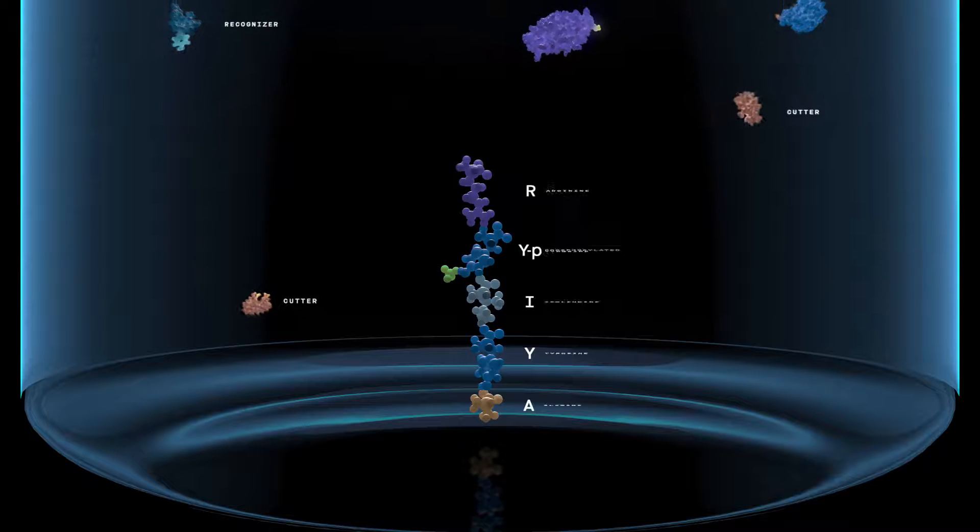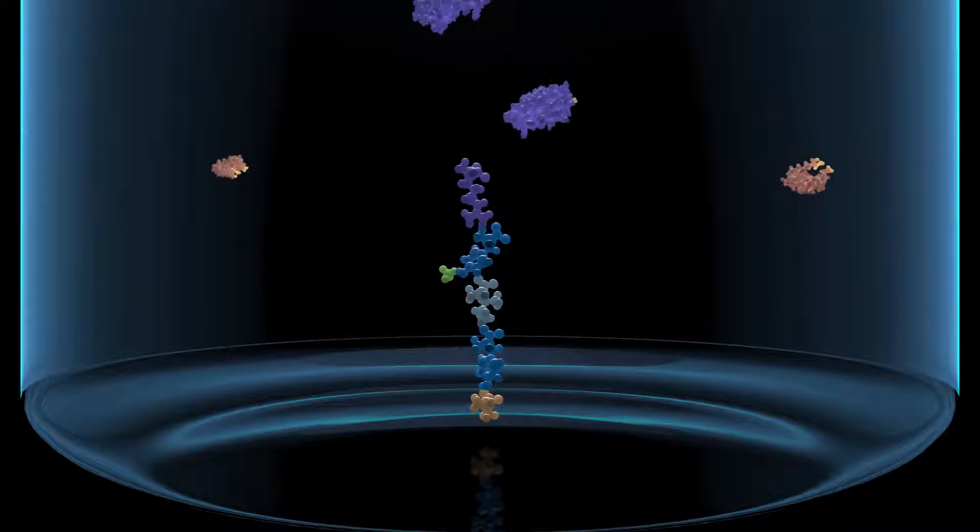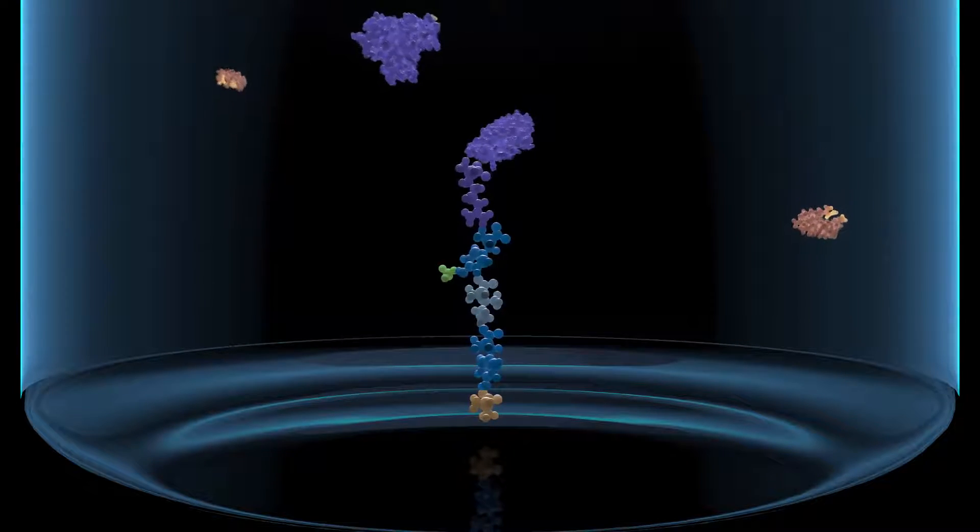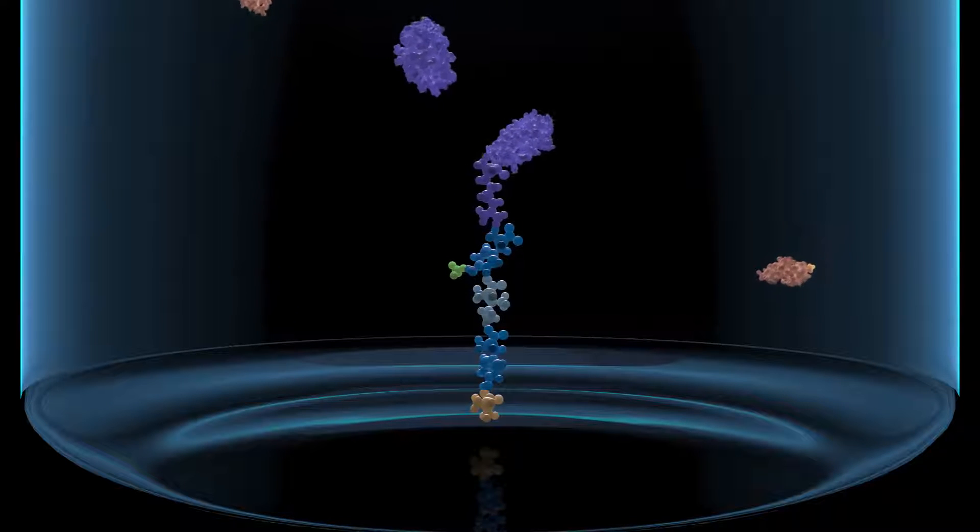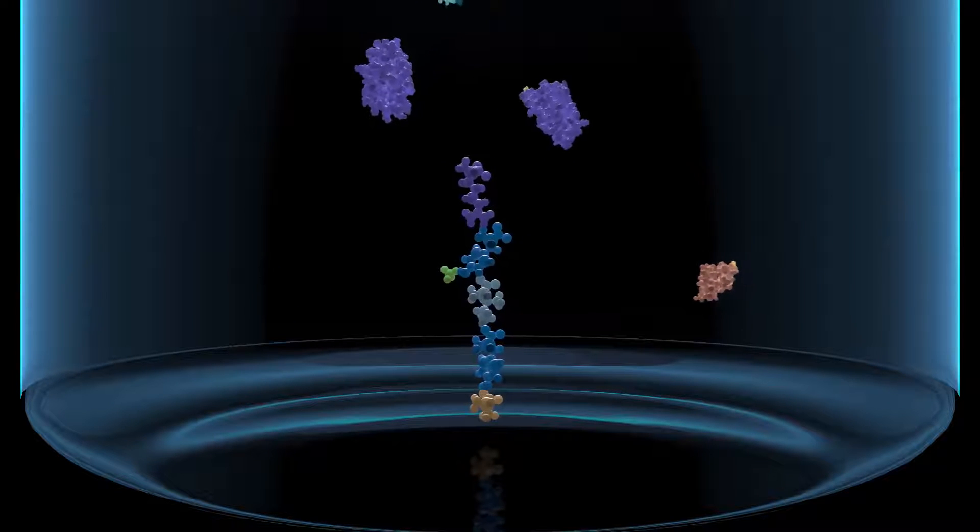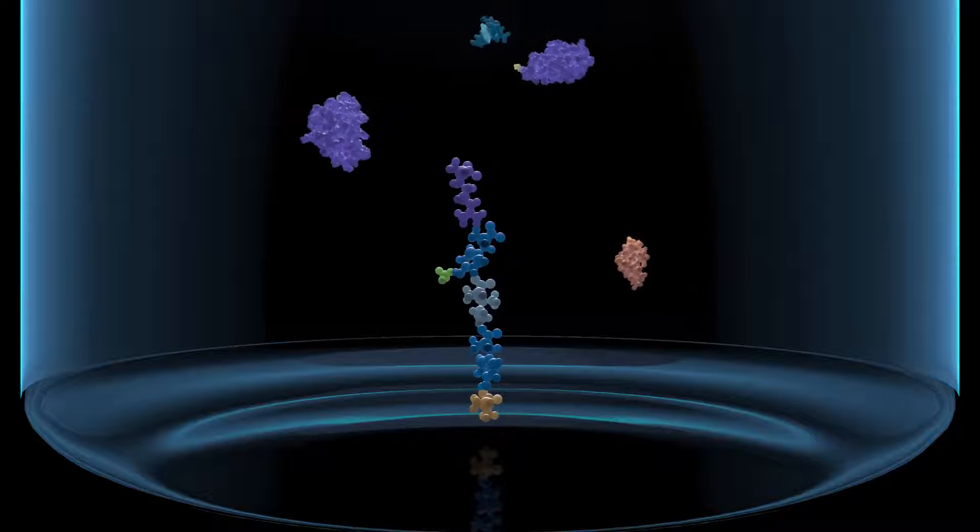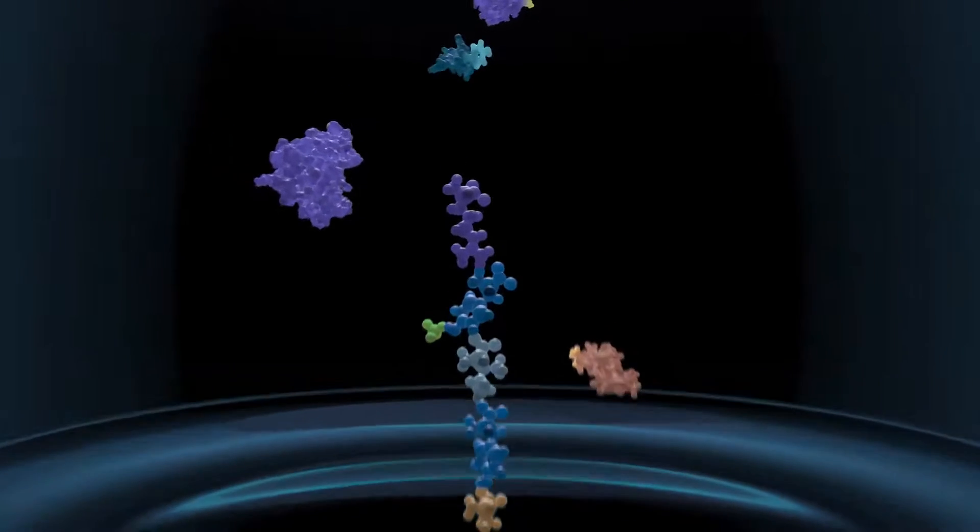Recognizers, each labeled with a fluorescent molecule, bind a terminal amino acid on each peptide. Recognizers bind and release from the terminal amino acid based on affinity and specificity, thereby generating a signal specific to the amino acid present.